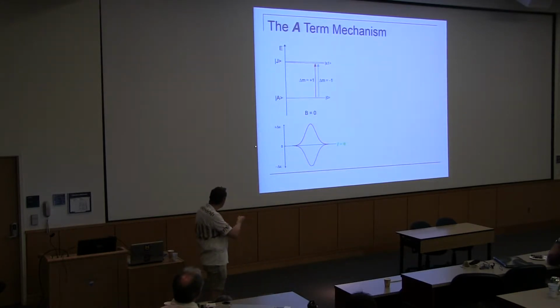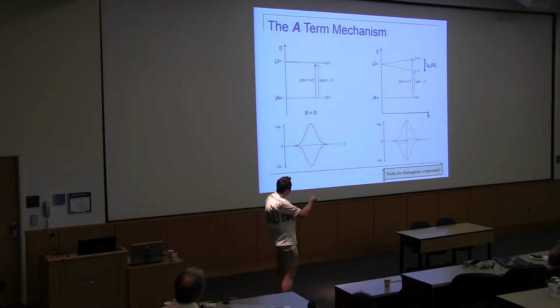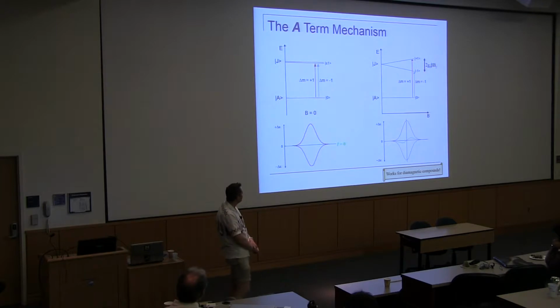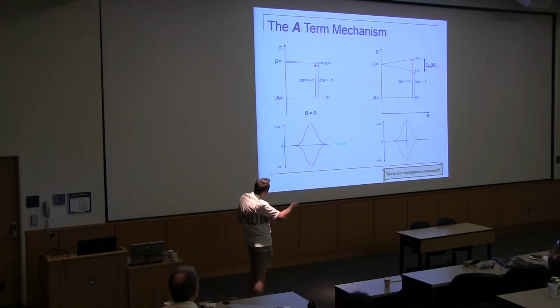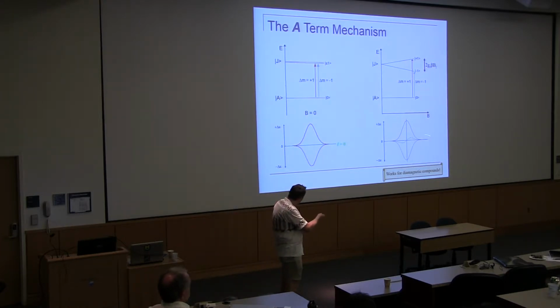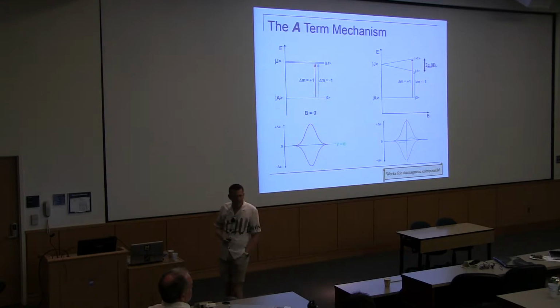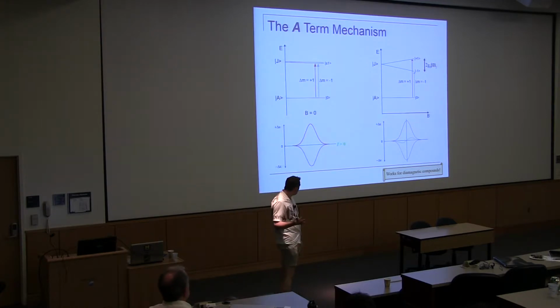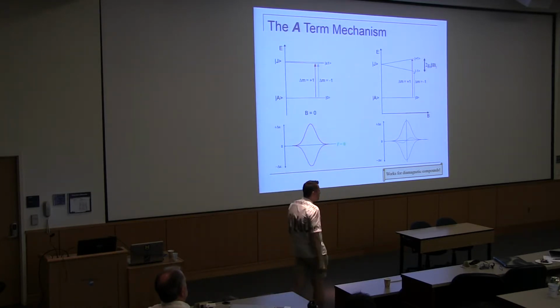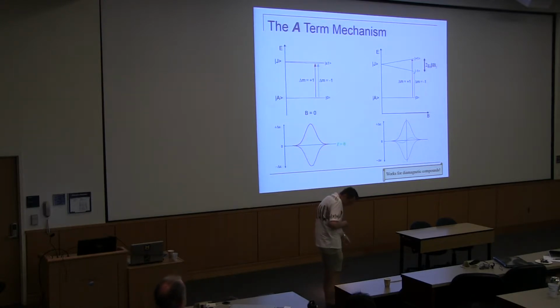And the resulting spectrum here is that green line. Nothing happens. But now when we apply the magnetic field, you can see there's a slight difference in the transition energy due to the Zeeman effect and the Zeeman splitting here in the excited state. So now we're taking our 2 absorptions, the red and the blue one, and we're offsetting them just a little bit. When you take the difference, you can see this kind of derivative-shaped signal results from that. And that is the A-term signal. So you can actually get an A-term signal for a diamagnetic compound if you have, for example, orbital degeneracy in excited states. And for porphyrins, for example, they have these E types of excited states. You can measure these A-term signals.